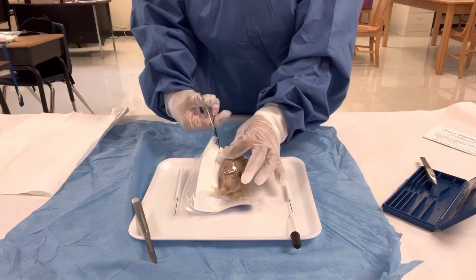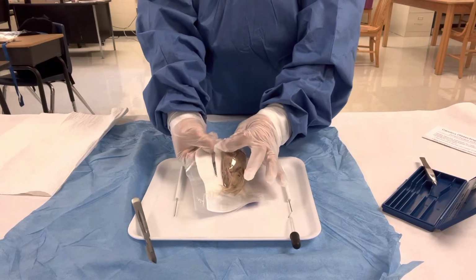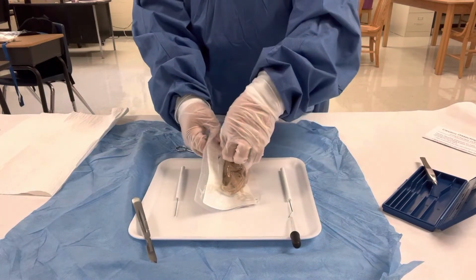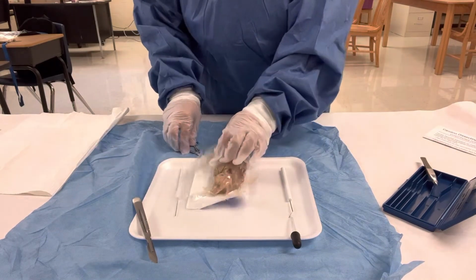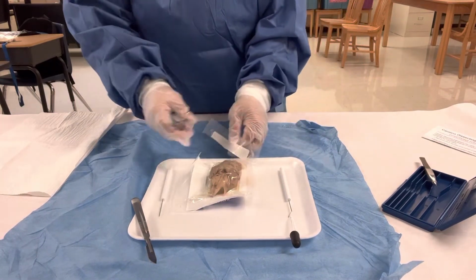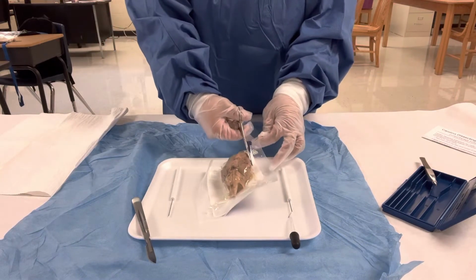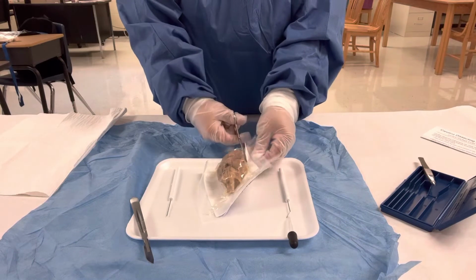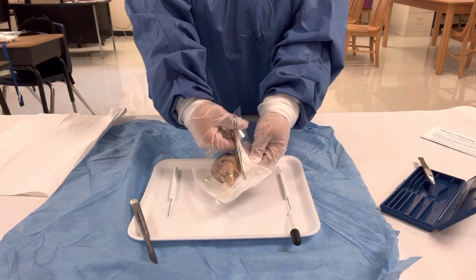Well, the sealed package is definitely sealed. I'm not pulling it. Ew, juice. This is gross. You're gonna get a lot of commentation because I talk to myself.